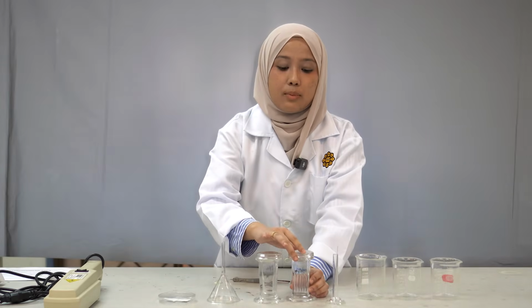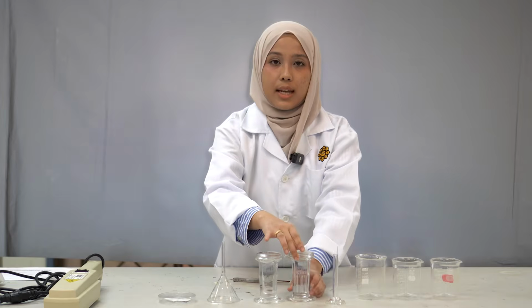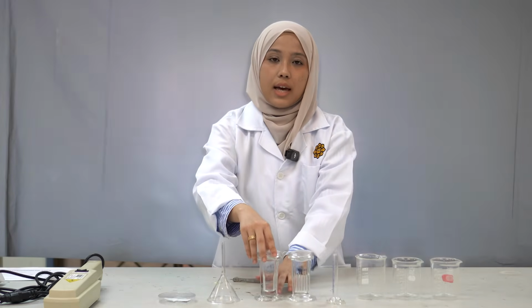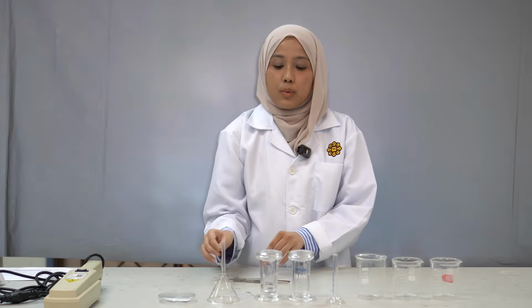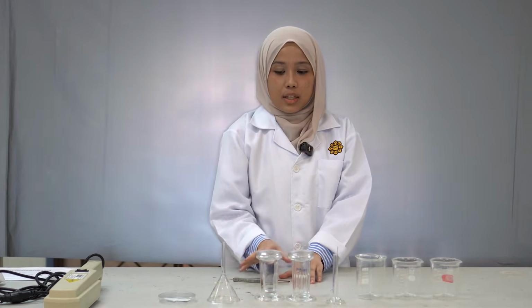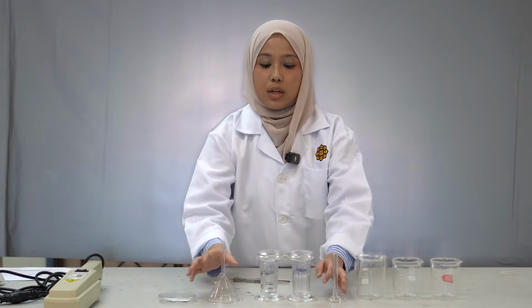We will have two developing solvents: first, a mixture of dichloromethane and hexane, and second, hexane and ethanol. We will prepare 10 milliliters, but we will put only 5 milliliters into the developing chamber using a filter funnel and a measuring cylinder.